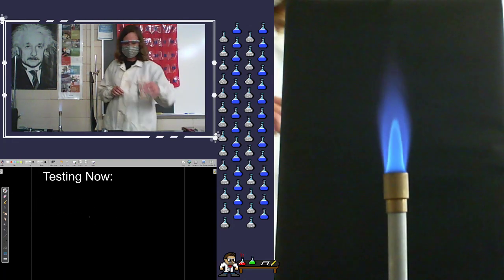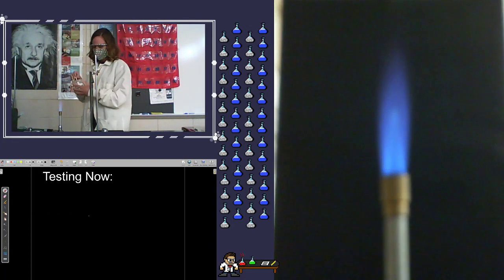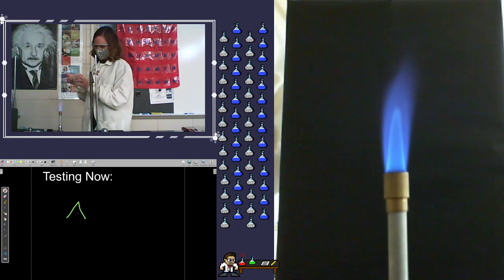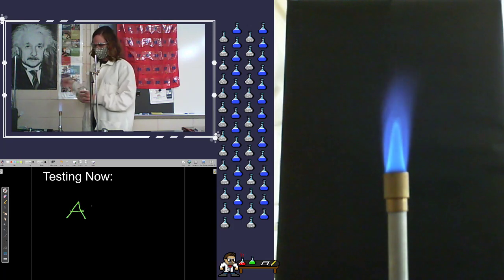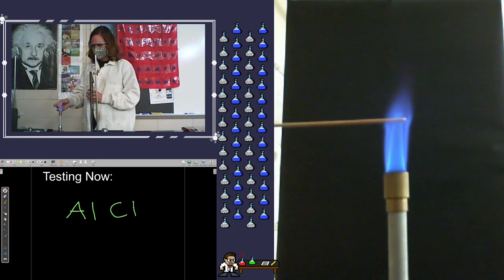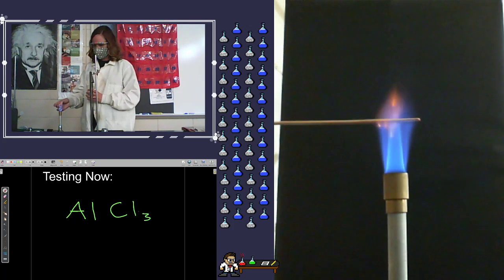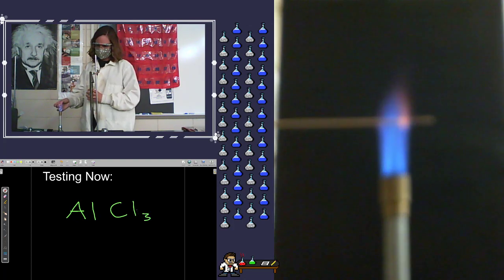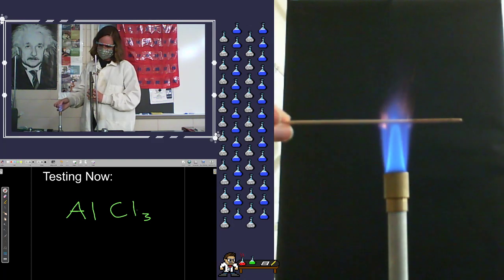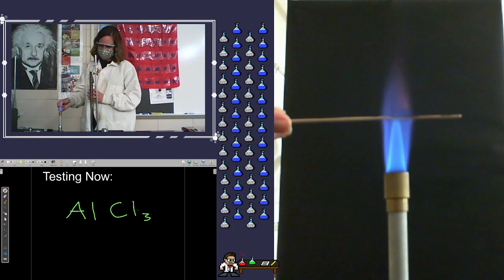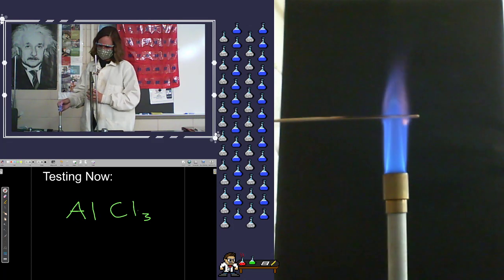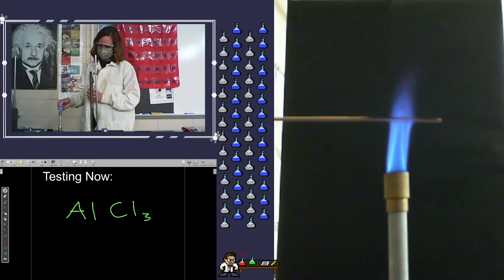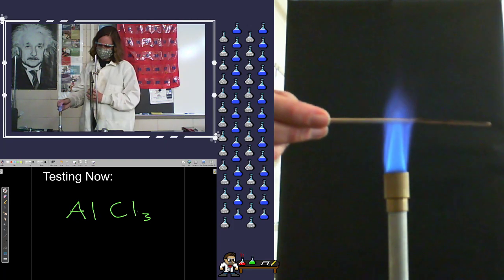And then the last one we have here is aluminum chloride. I'm not sure we have enough energy for that transition. Doesn't look like it. This one also is usually more of a texture thing than a color thing. So I think they'll see a little bit of it here.